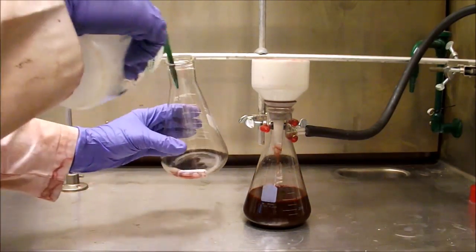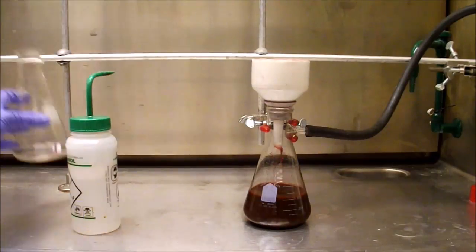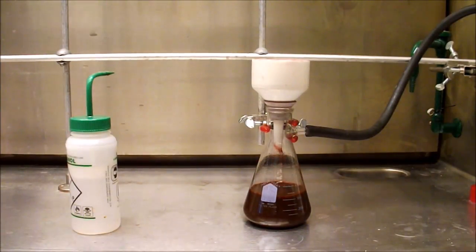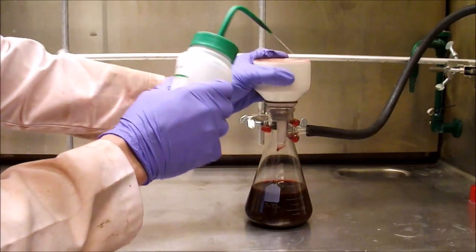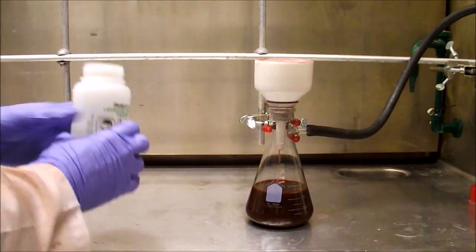While the solution is quite dark, this only represents a small amount of PDI and is a relatively small loss of product. A small amount of methanol is used to rinse the Erlenmeyer and the sides of the Buchner funnel.